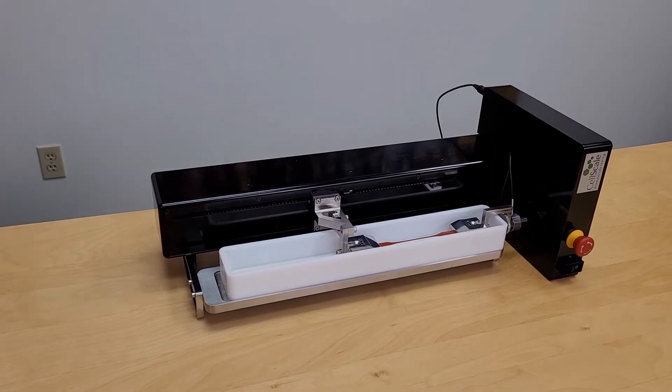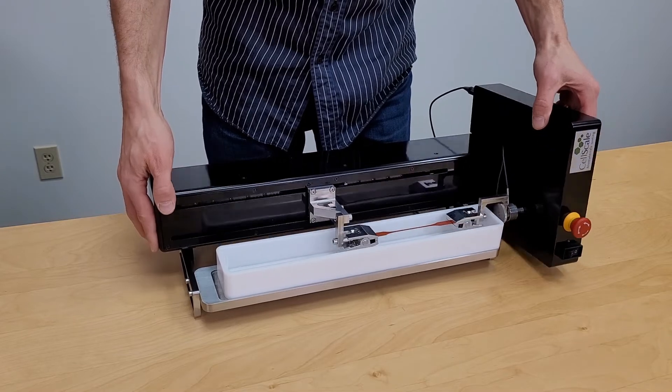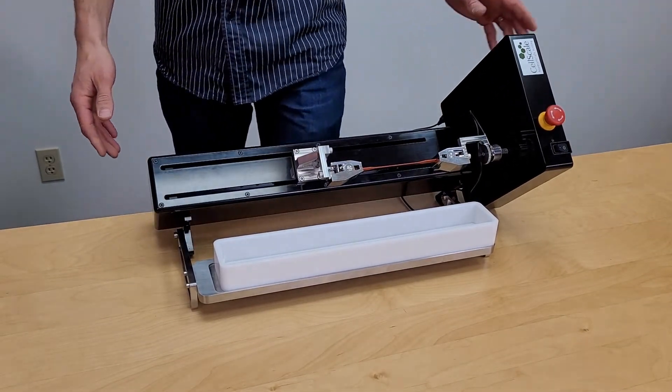Both tension and compression testing can also be done horizontally. This allows the use of a media bath and the system can be pivoted to allow easy specimen mounting and unmounting.